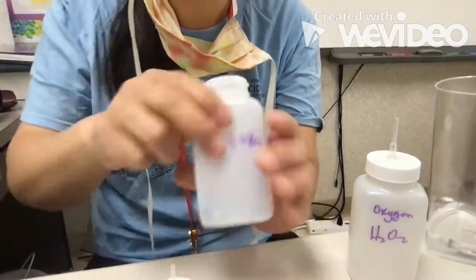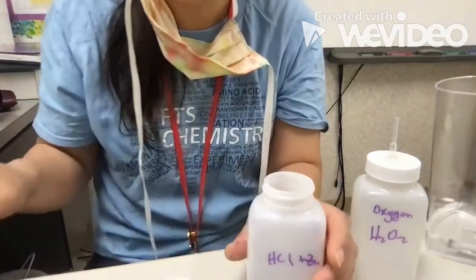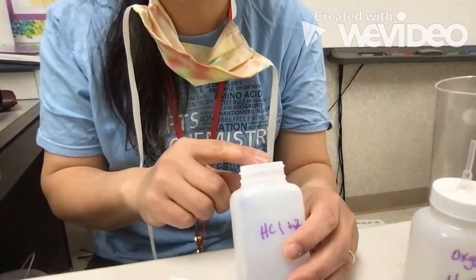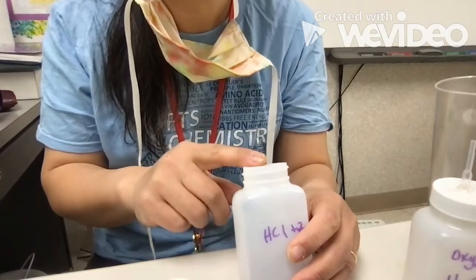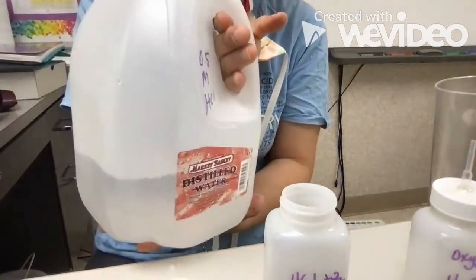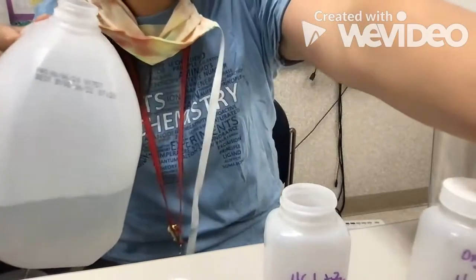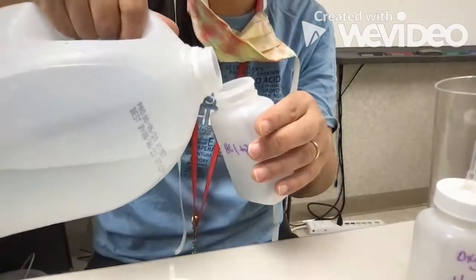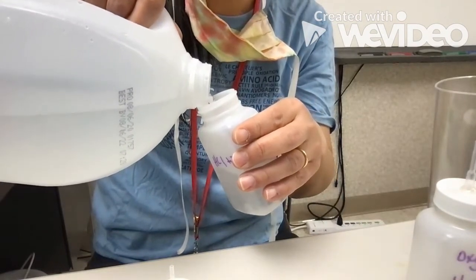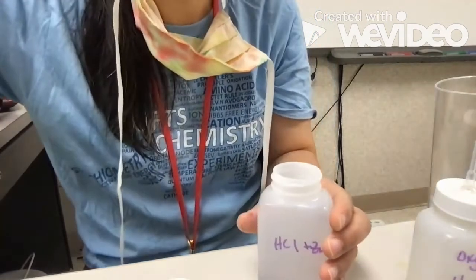Okay, and kind of cover the bottom of your container with that, and then you will add in here the HCl to make the hydrogen. Okay, so I have here 0.5 molar HCl. So then I'll add this in right here. And you're going to fill it up pretty much all the way to the top here.